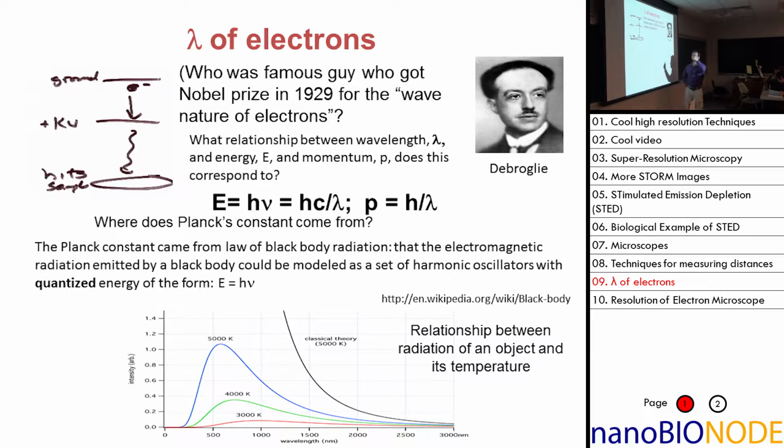What they have is, remember, they heat up a filament, and then it gives off a few electrons, and then they put a voltage there.